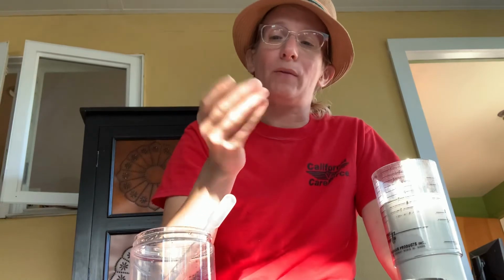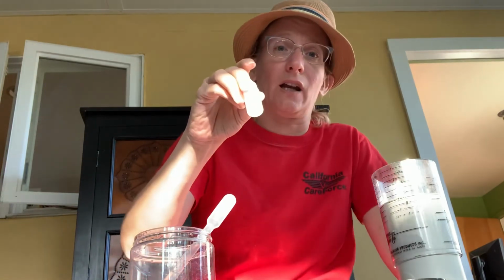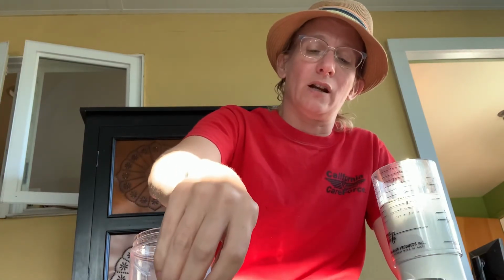If it does kind of halfway in between that, where it kind of clumped up some, but it didn't actually go to that apple juice clarity color, then you might have European Foulbrood in there, according to what the websites and everything say. I did not get any positives on my test, but it was a nice thing to be able to run that cheaply and easily for a little extra peace of mind.